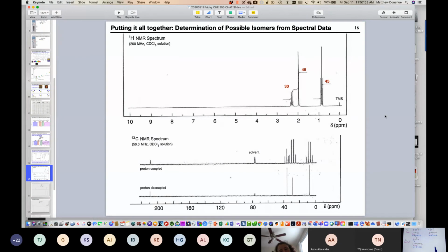So let's go back and look at the screen. Look at this proton data, this proton NMR. So Katie asked, when I numbered these carbons, why didn't I number that one? Just briefly, what I did was I looked at the longest carbon chain. I counted that 1, 2, 3. This thing that occurs outside is called a substituent. This is the carbon that methyl group is bonded to, so that's why I didn't number it.